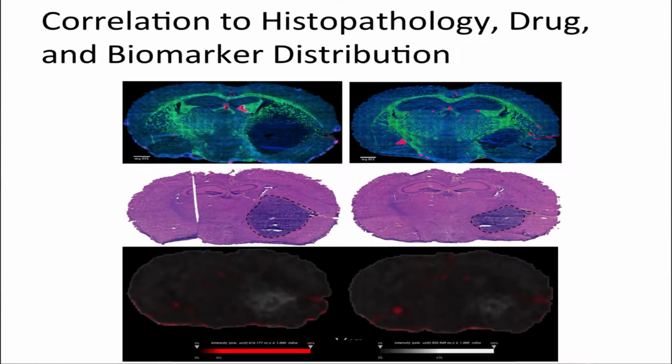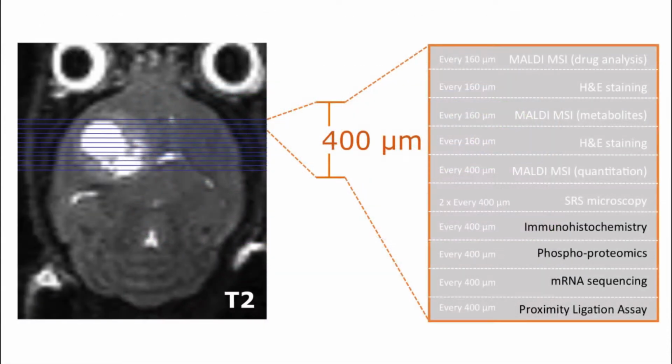So what we are doing is correlating, and I say we, that's when that unifying theory will come together, is basically looking at the tissue characteristic by microscopy, by H&E, and correlate this to, in this case, drug and one of the biomarker, but also drug distribution, and then the list goes on to bring them together. And now, basically, that was pharmacokinetics.